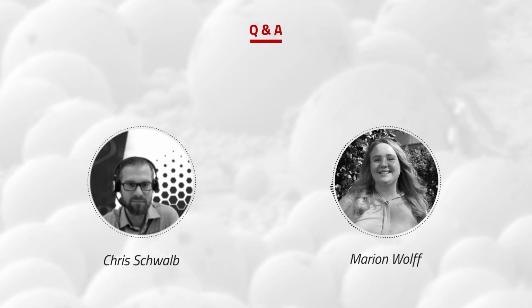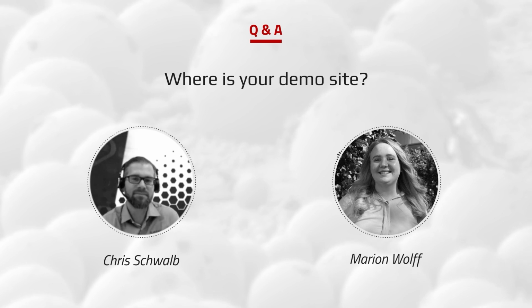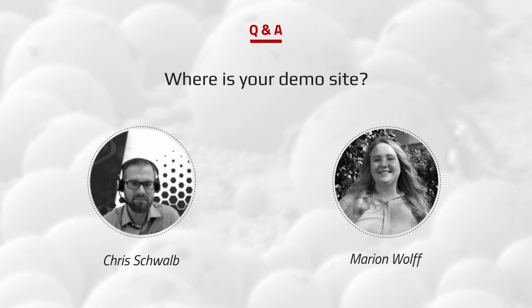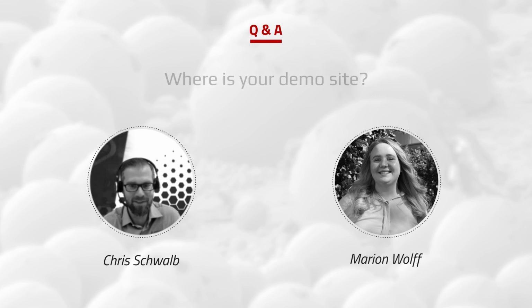Another question, and that's a very good question: where is your demo site? I think we forgot to mention that. We are located in Darmstadt in Germany, which is close to Frankfurt. We have a demo site here where we also do most of the customer sample measurements, but of course we also have an application lab in San Diego. So feel free to visit us. If you would like to drop by with your sample, you're more than invited. If San Diego is closer, then probably go there, but we are always happy to have visitors and demonstrate the tool here in our demo lab.